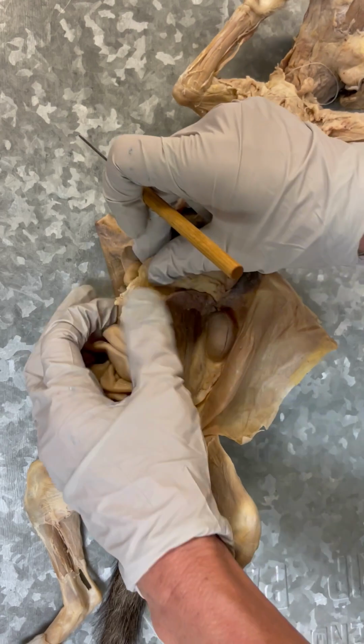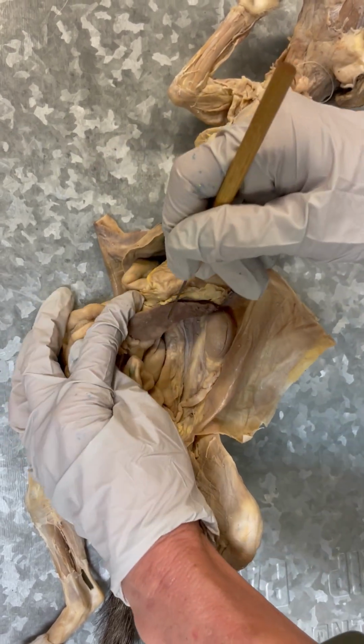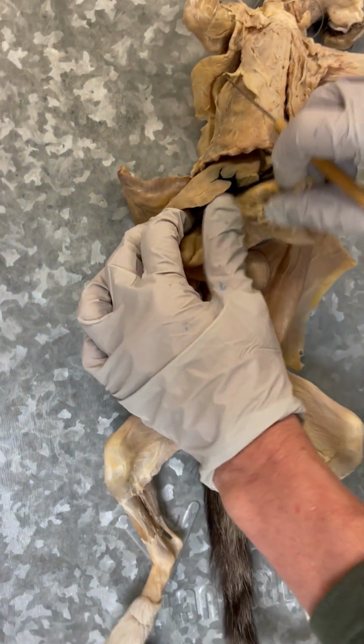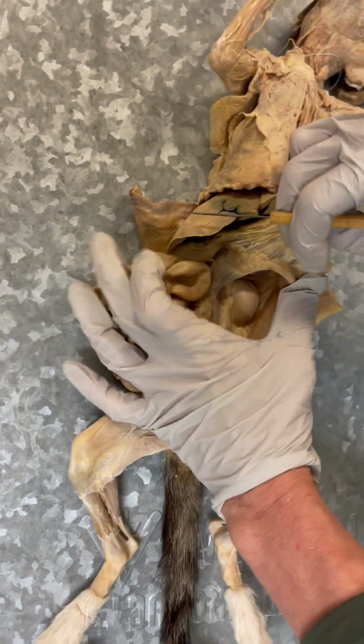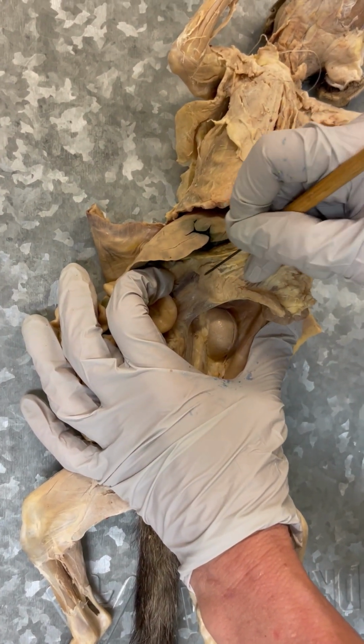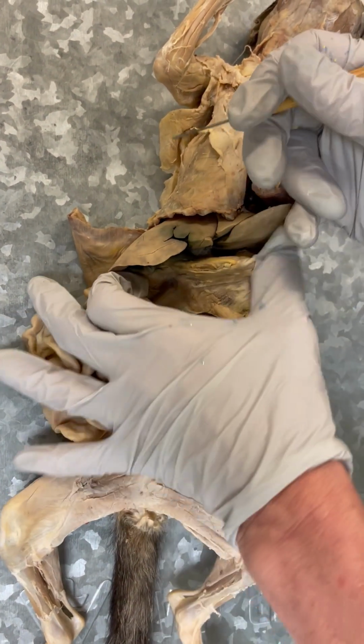Lifting up the omentum this way, you see the spleen, and lifting it up below the stomach, you can see the pancreas. So this is the pancreas right here, this whole thing from here to here.